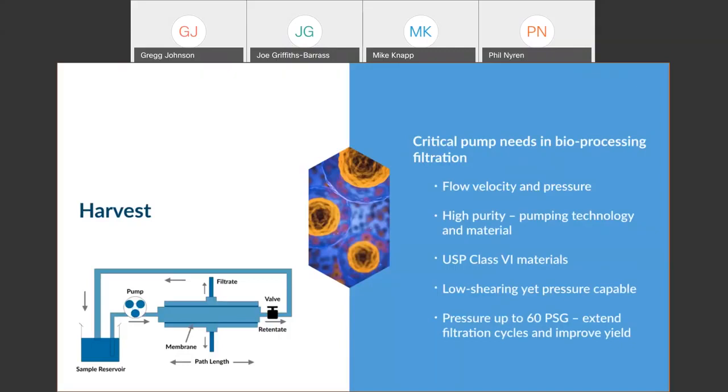The second process we want to look at is tangential flow filtration, also known as cross-flow filtration. The majority of the feed in these filters flows or travels tangentially across the surface of the filter rather than across in the filter as with dead-end filtration. The principal advantage of tangential flow filtration is that the filter cake, which oftentimes blinds the filter, is substantially washed away during the filtration process. This increases the length of time that a filter unit can be used, and it can also be used as a continuous process, unlike batch-wise or dead-end type filtration.